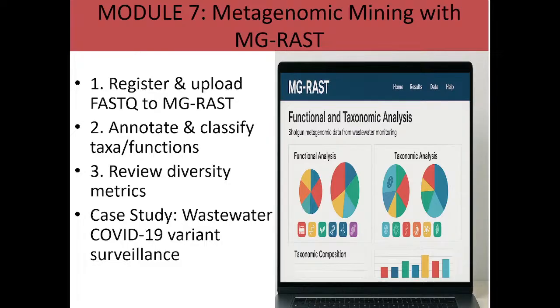In fact, let me tell you one secret about bioinformatics. One very funny thing is that you might use a tool this morning and that tool might not be there in the afternoon. In bioinformatics, there are different approaches to the same goal.